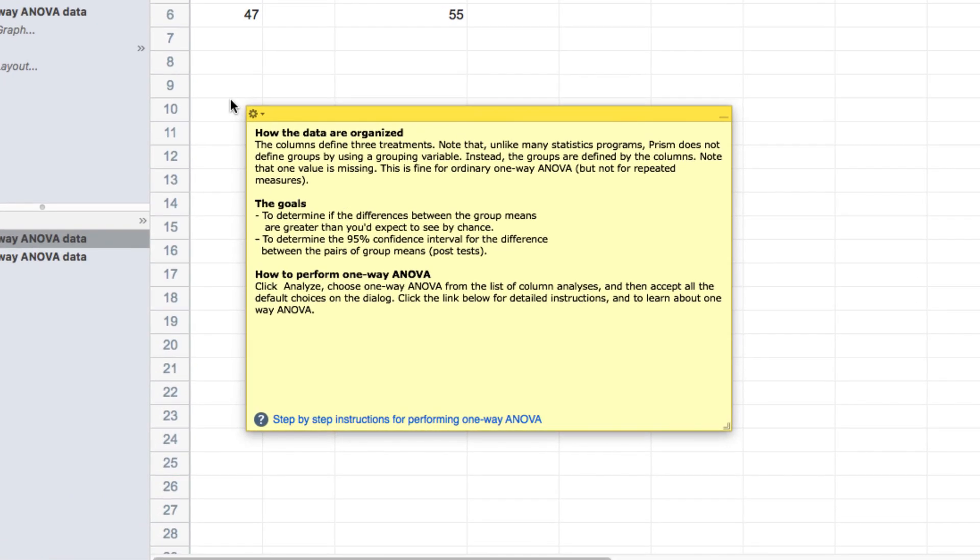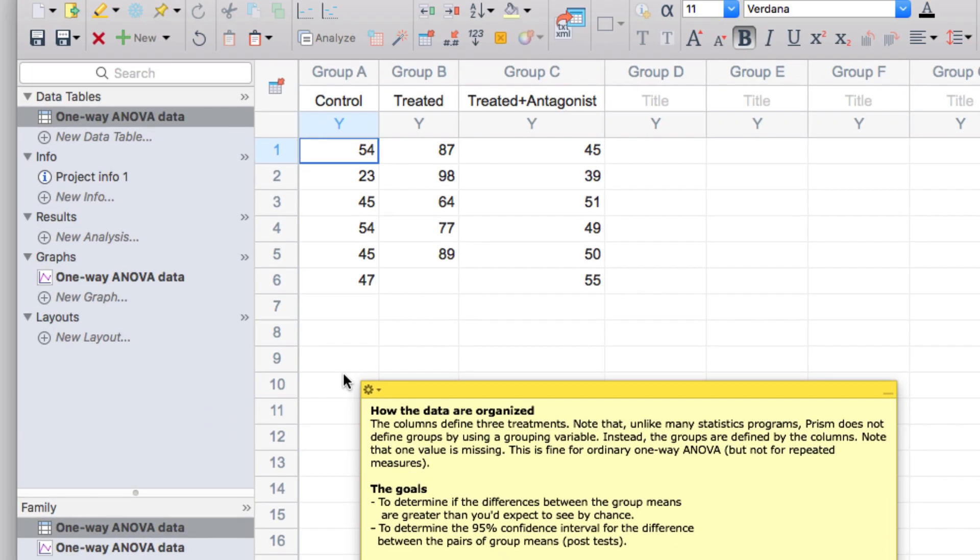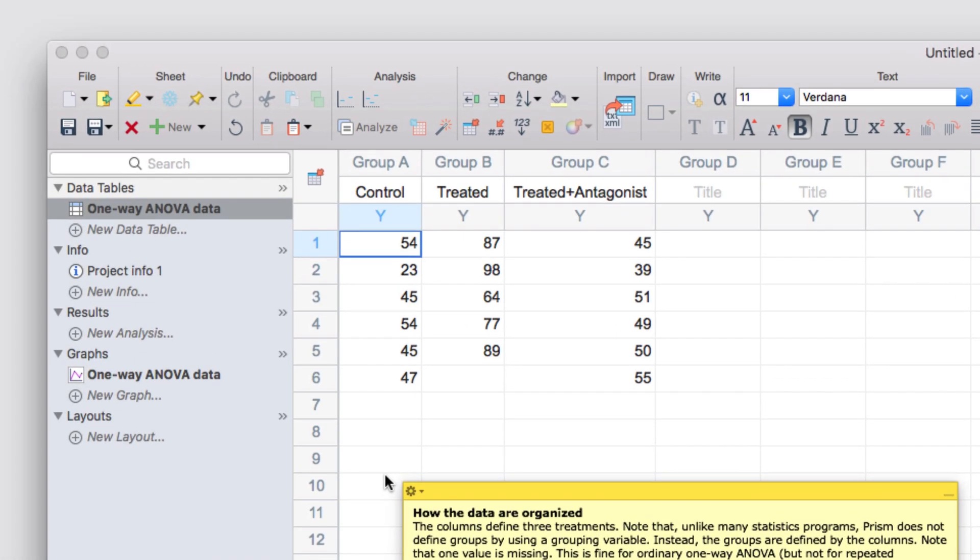These data sets will also provide instructions that cover the basic structure of how the data are organized, the goals of the tutorial, and some brief instructions for how to achieve those goals, which are typically to perform the analysis of interest, in this case a one-way ANOVA. These instructions are shown on a floating note on the data sheet, and you can add your own floating notes by clicking on the floating notes button in the sheet section of the toolbar.